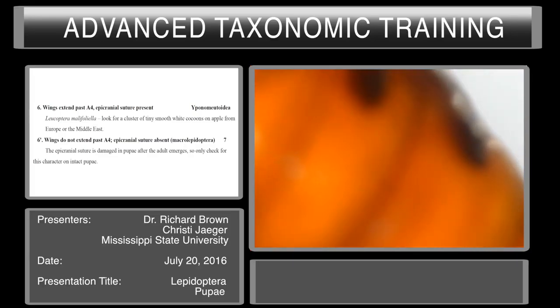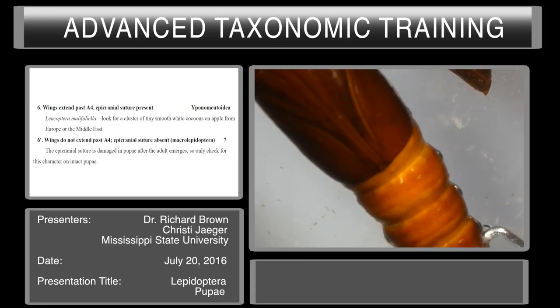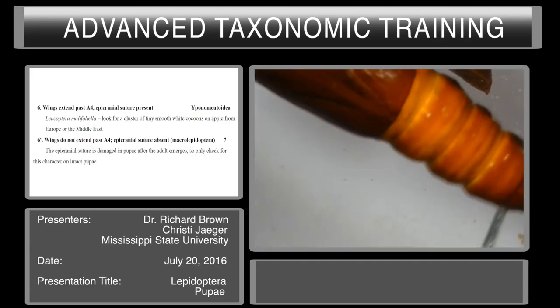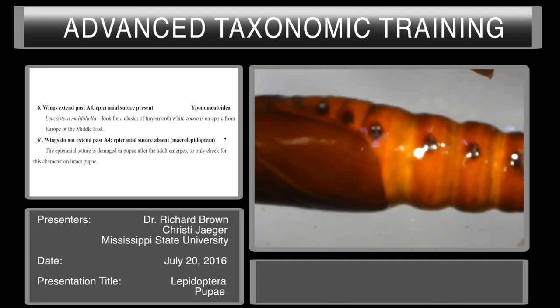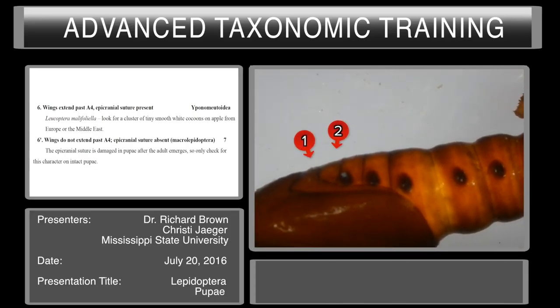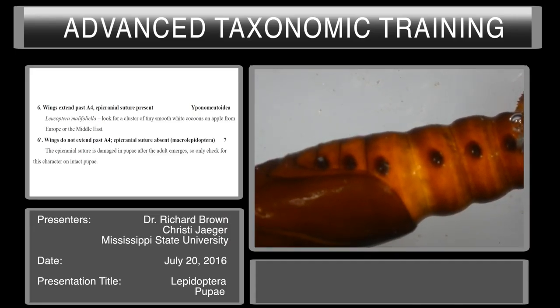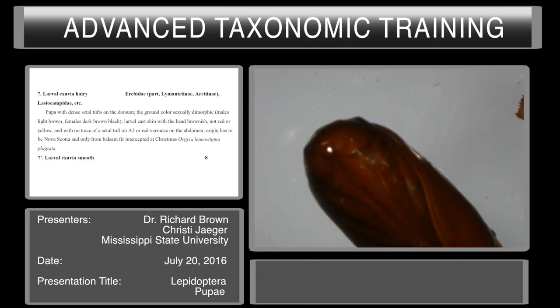We continue to couplet six. For this character we'll need to flip our specimen over again and we're looking at the wings: wings extend past A4, or wings do not extend past A4. To get a better view we'll look at the side so we can count the segments — one, two, three, and the fourth segment — and we can tell that the wings do not extend past the fourth segment. So we go to couplet seven. Had they extended past the fourth segment we would be in the Yponomeutoidea.